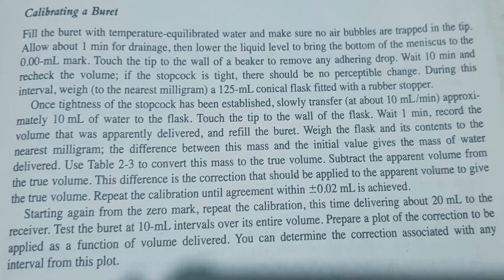So during this interval, you have to weigh your receiving flask. Okay, as stated here, during this interval, weigh to the nearest milligram a 125 ml conical flask fitted with a rubber stopper. This is your receiving flask. You take it empty, but it can have a stopper, a closure. You can use a rubber stopper, or sometimes a cork, but the cork is actually not recommended. Anyway, as long as it has a closure and is empty. Once the tightness of the stopcock has been established, okay.